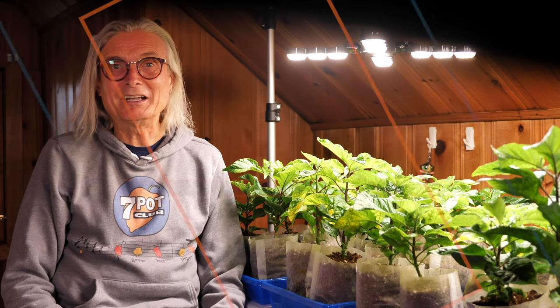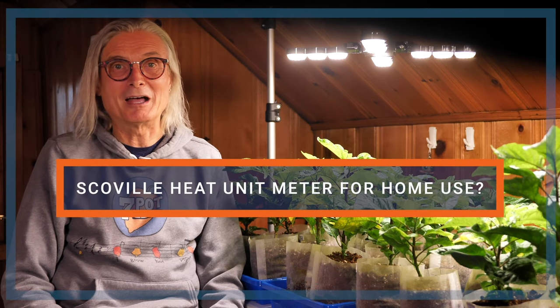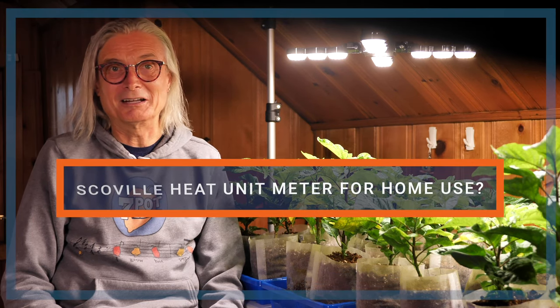Welcome to 7 Pot Club. I'm Rob. Have you heard about the device that pairs with your iPhone to quickly and accurately test the heat level of hot peppers, hot sauces, and other chili products?